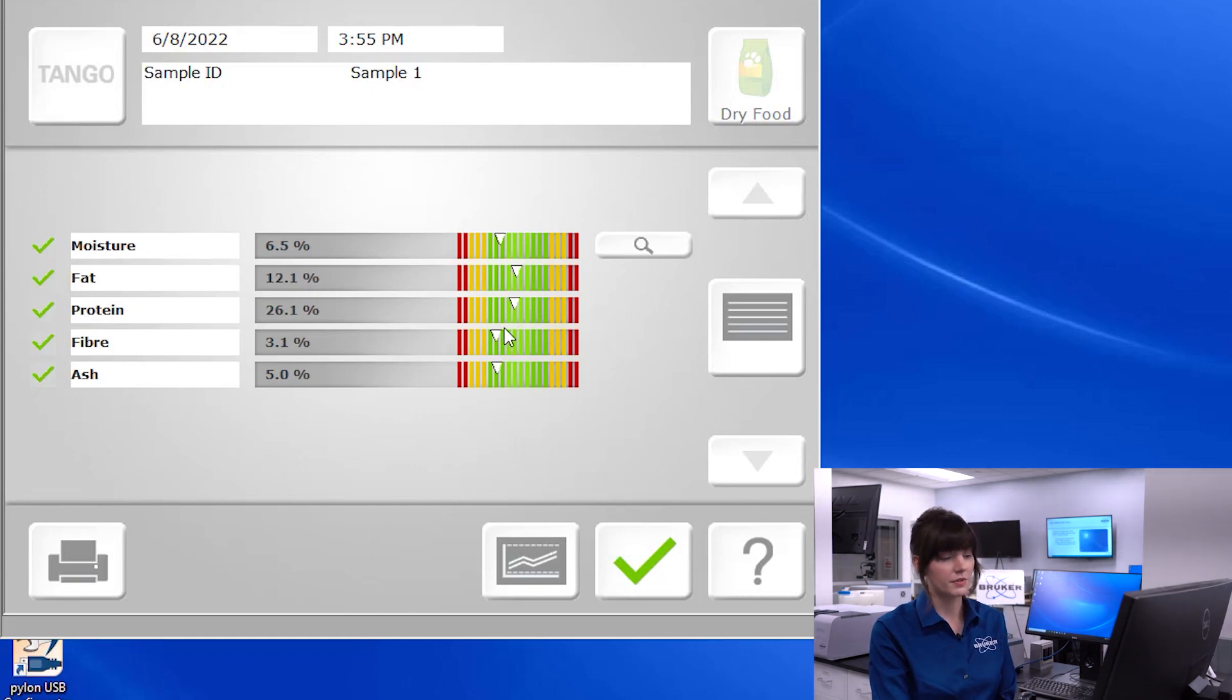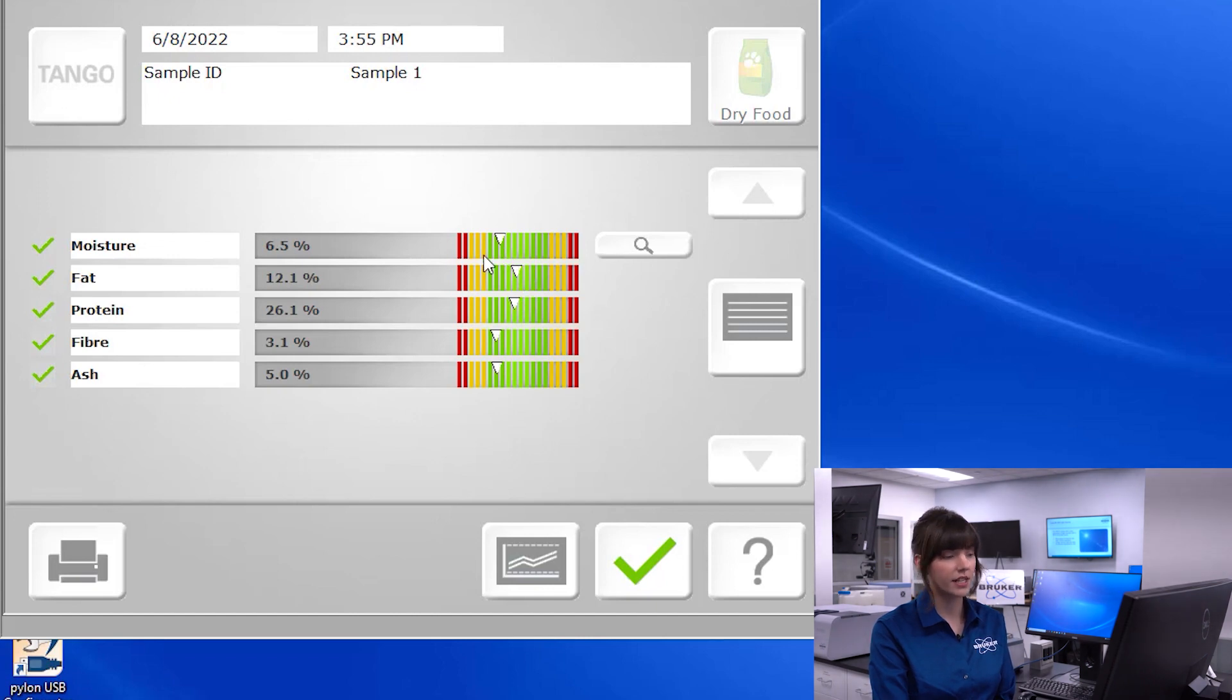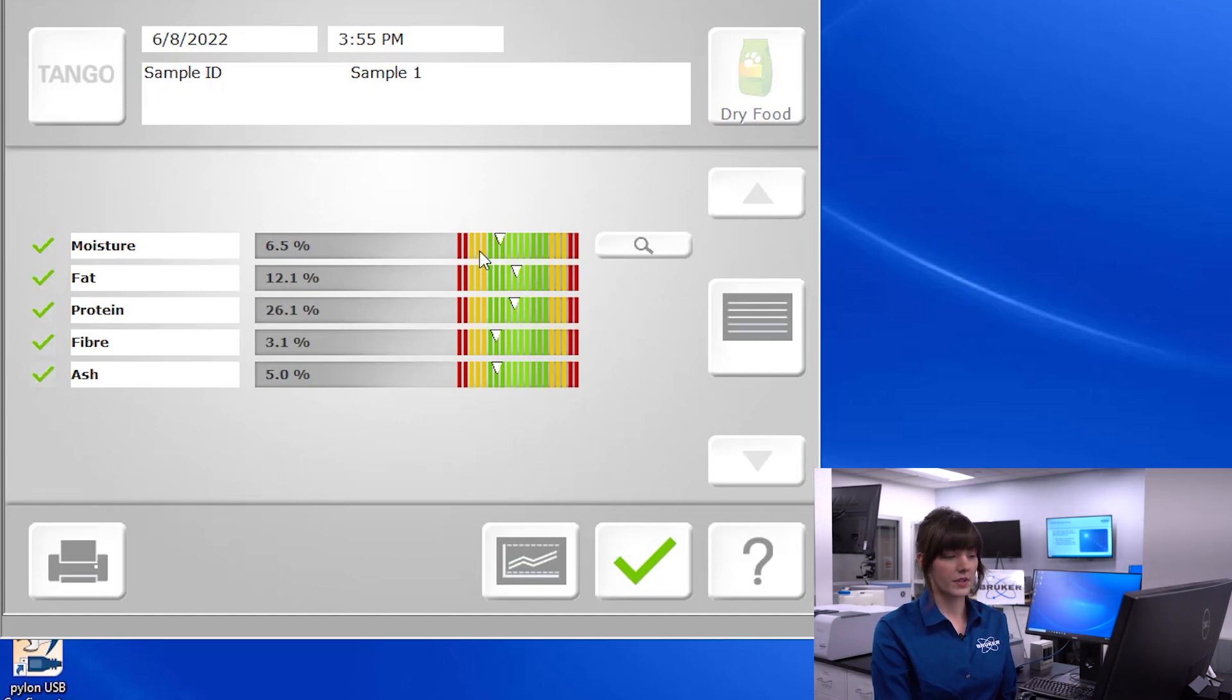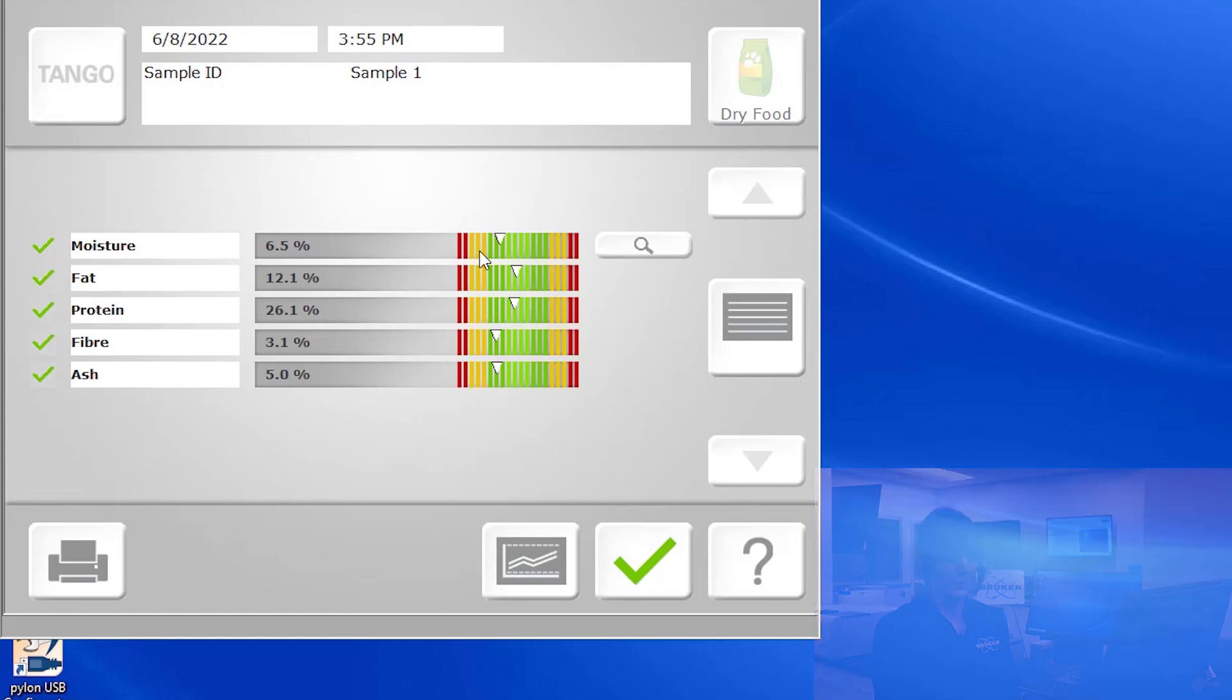In your setup screen, you're able to define limits. Red depicts what's out of tolerance, yellow indicates your cautionary limits, and green indicates what is acceptable. These signify to your operators what qualifies as a good sample versus what may need to be sent off for wet chemistry.